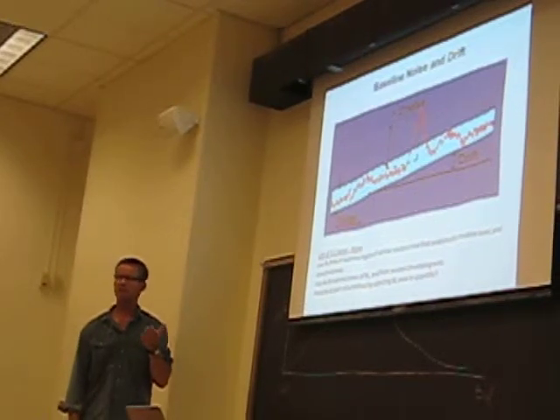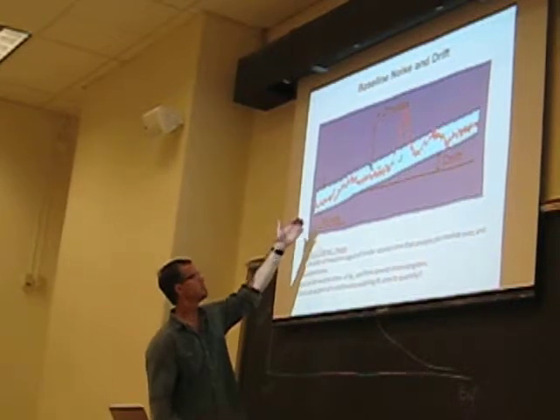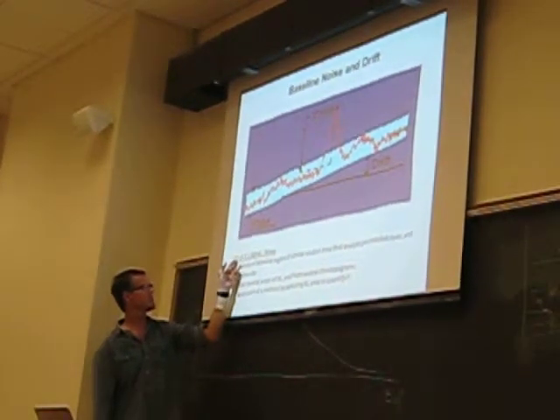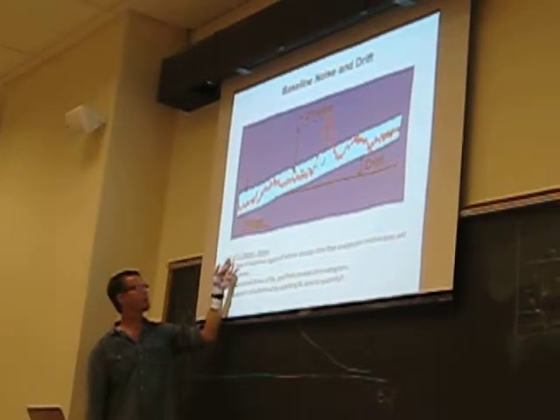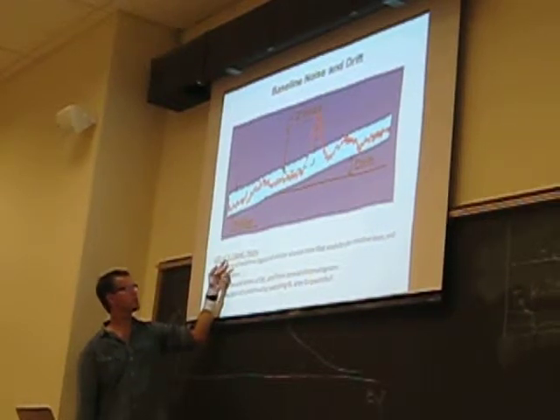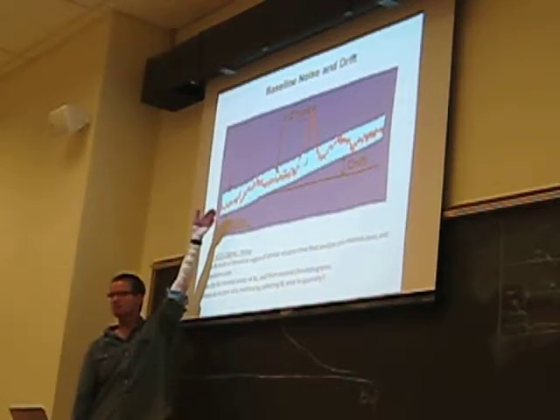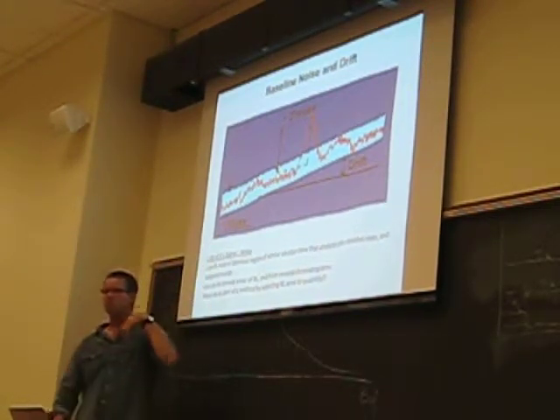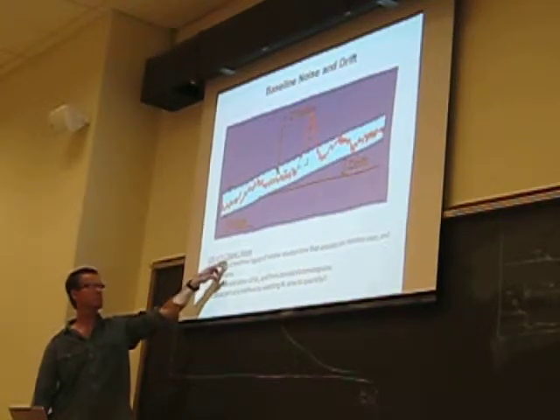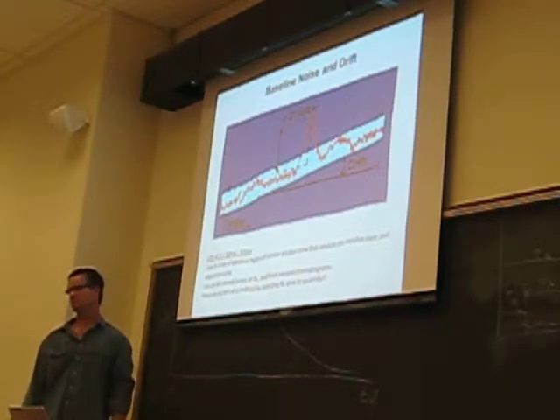Or, if I don't have the luxury to do that, because we have some other things to analyze, I can try to evaluate what my baseline noise is, and use a simple approach that my detection limit can be estimated by assuming a ratio of 3 to 1 for my signal to noise ratio. So I can characterize what my baseline noise is, and multiply that by 3, and then estimate a limit of detection using a 3 to 1 signal to noise multiplier.